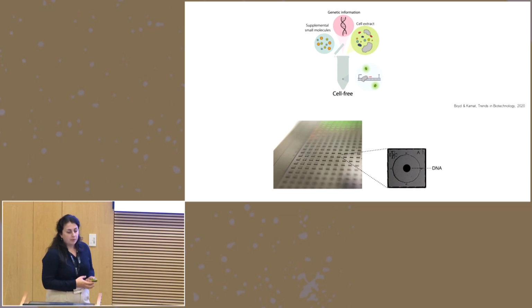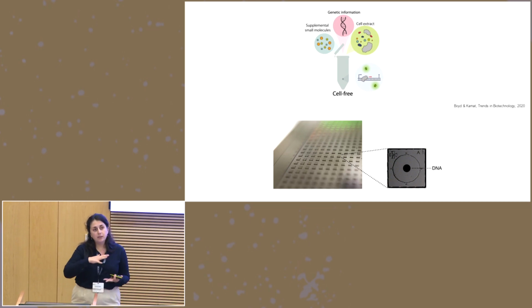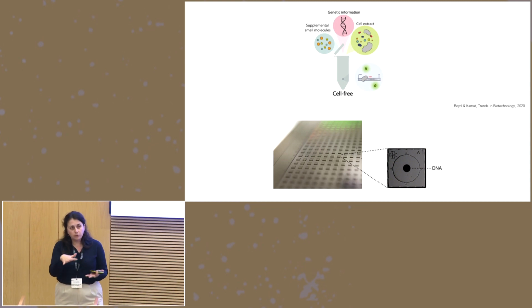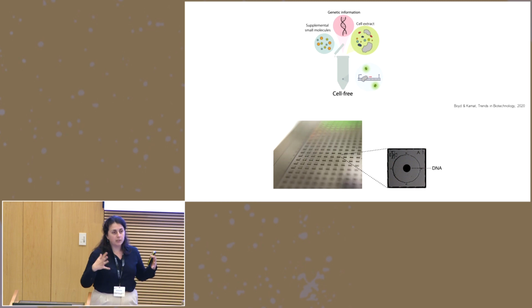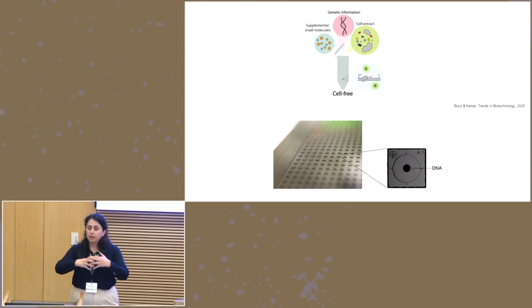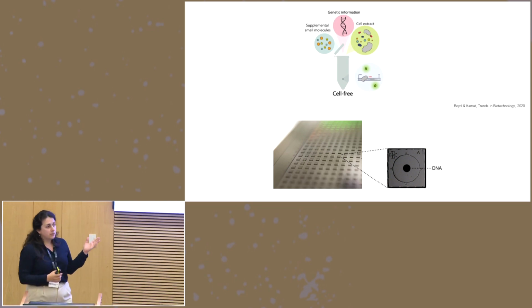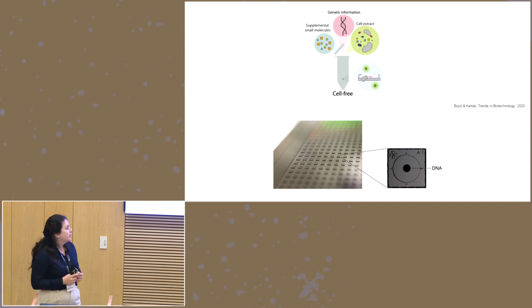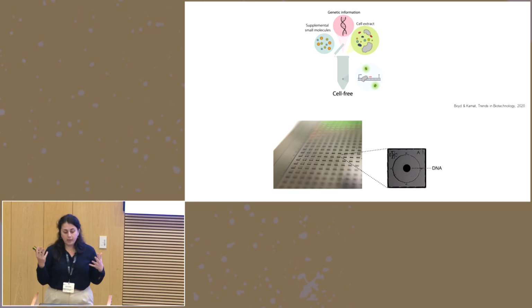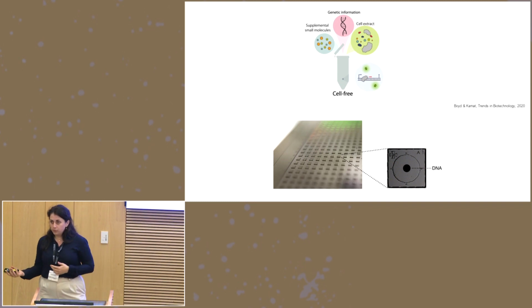My lab is focusing specifically on trying to look at artificial cells in a spatially resolved manner. What that means is basically we're imagining making an artificial cell as if you would take a cell and break it open and spread it out on the surface. We use silicon chips, the same material that is in microchips in your phone. The lab developed a method to bind biomolecules to silicon chips. So we can bind DNA, we can bind proteins.